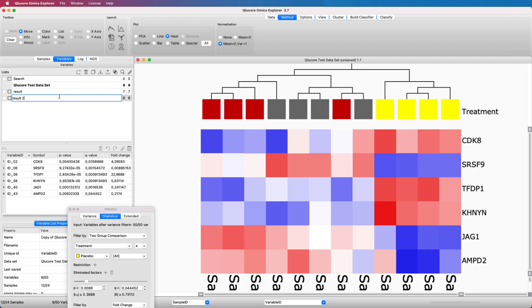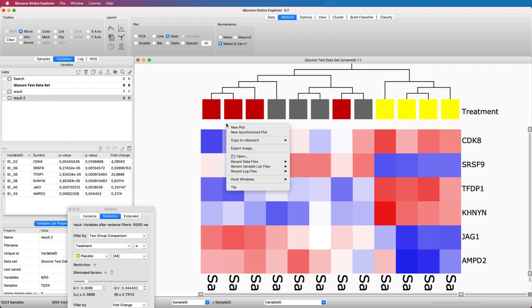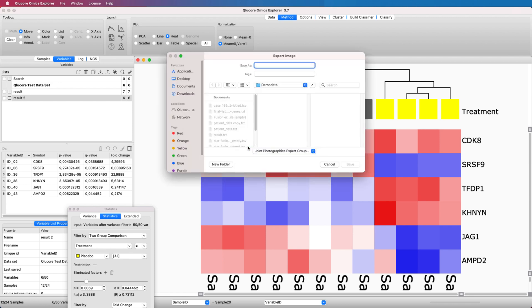Images are also easily exported. Right-click in the plot that you want to export and select Export Image. You can select various export formats and resolutions. You can also include additional information such as the color legend.